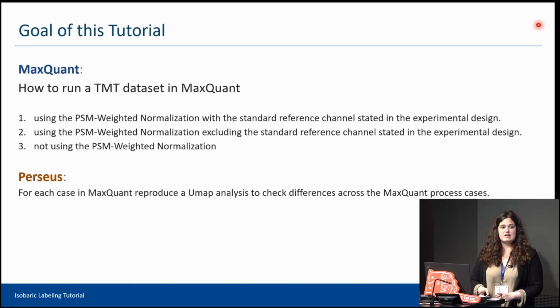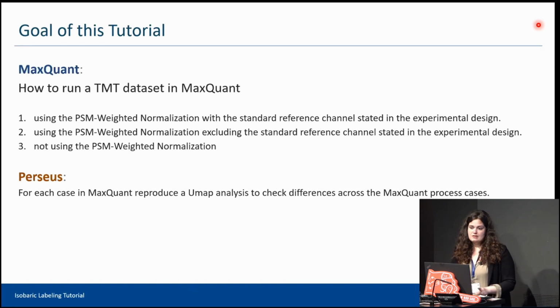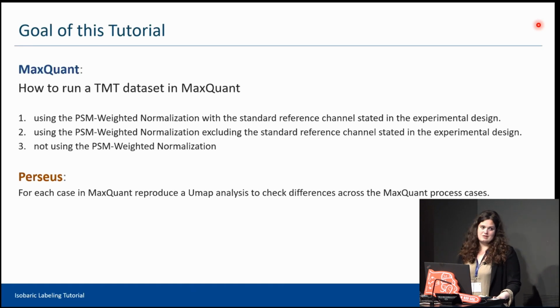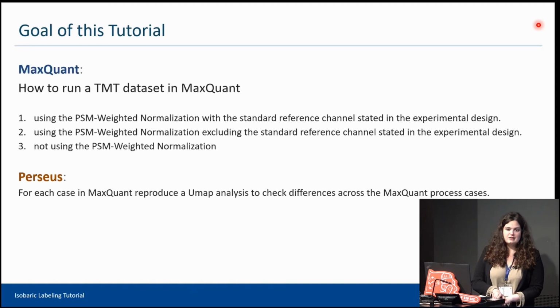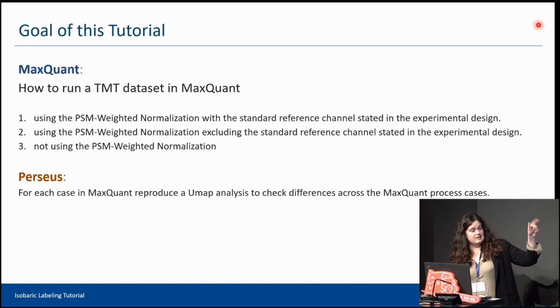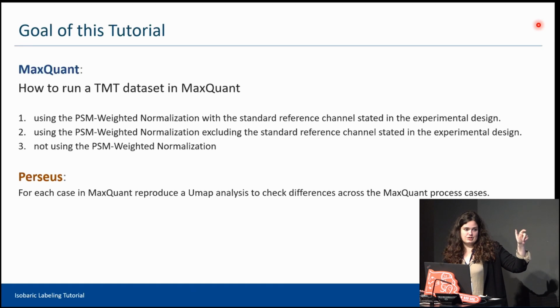What I will show you is that we will take one of them, and I will show you how to do the analysis of that one. And if you reproduce exactly the same analysis with the other protein groups, using exactly the same parameters and everything, you will see exactly the difference between using and not using a different reference channel setting in MaxQuant.